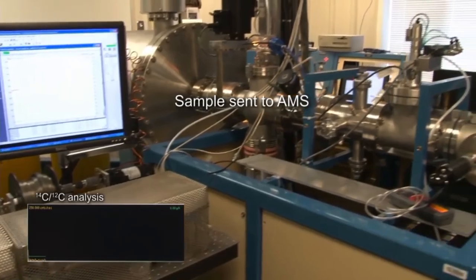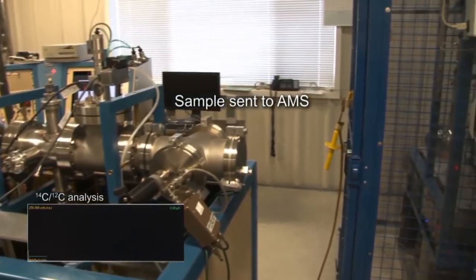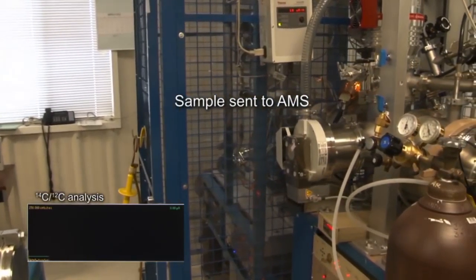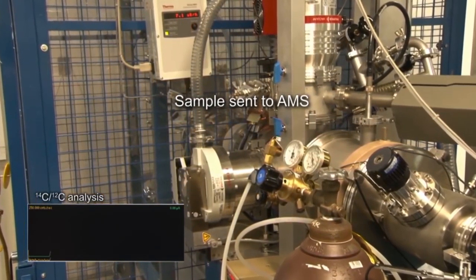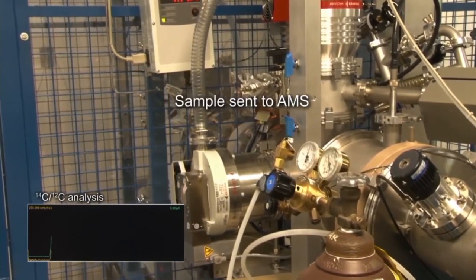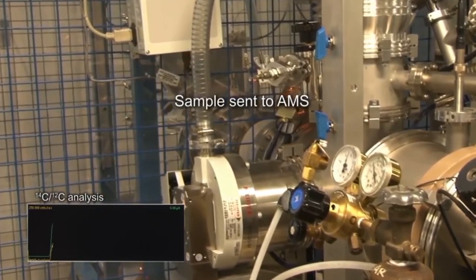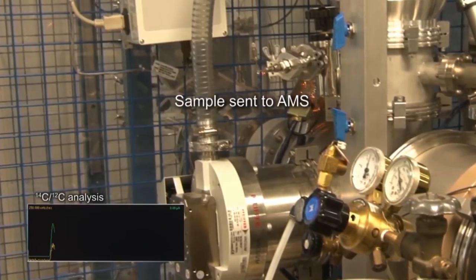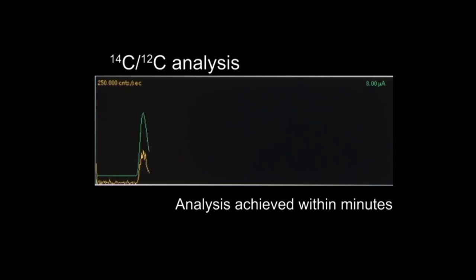And that goes through a combustion oven, which combusts it into CO2. And then the CO2 gets transferred through a very small tube called the capillary tube and gets sent to the AMS. And the AMS then measures the CO2 gas, which has your carbon-14 atoms in it from your sample. As it gets measured, we get a graphical representation of how much C14 is there compared to how much C12 as well. And as you can see on the bottom there, which will get big right now, we get a graphical representation of the ratio between C14 and C12.